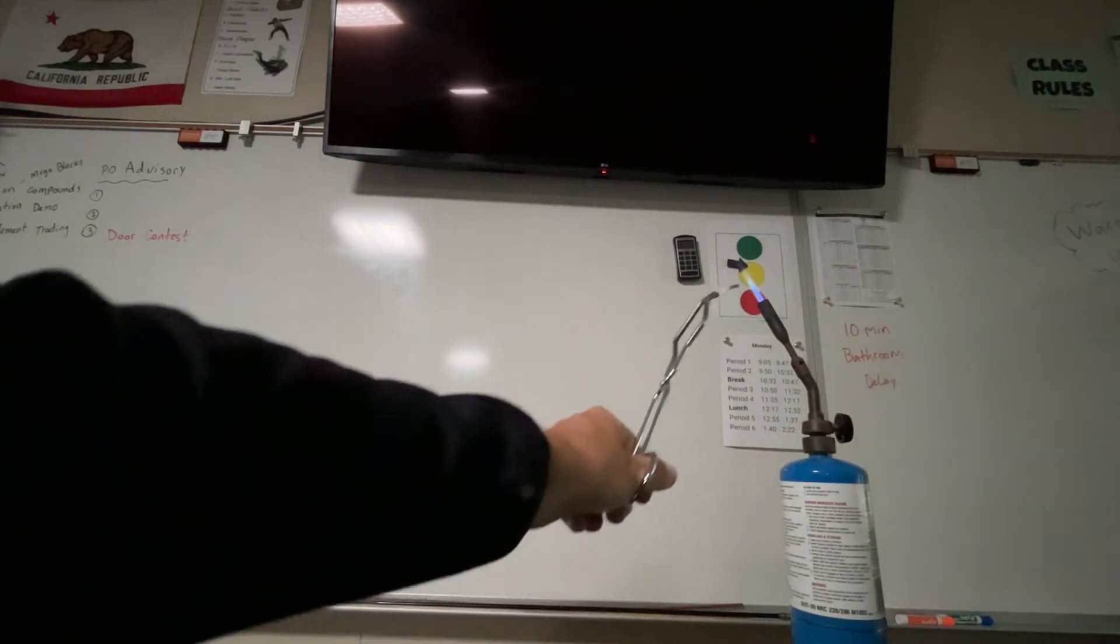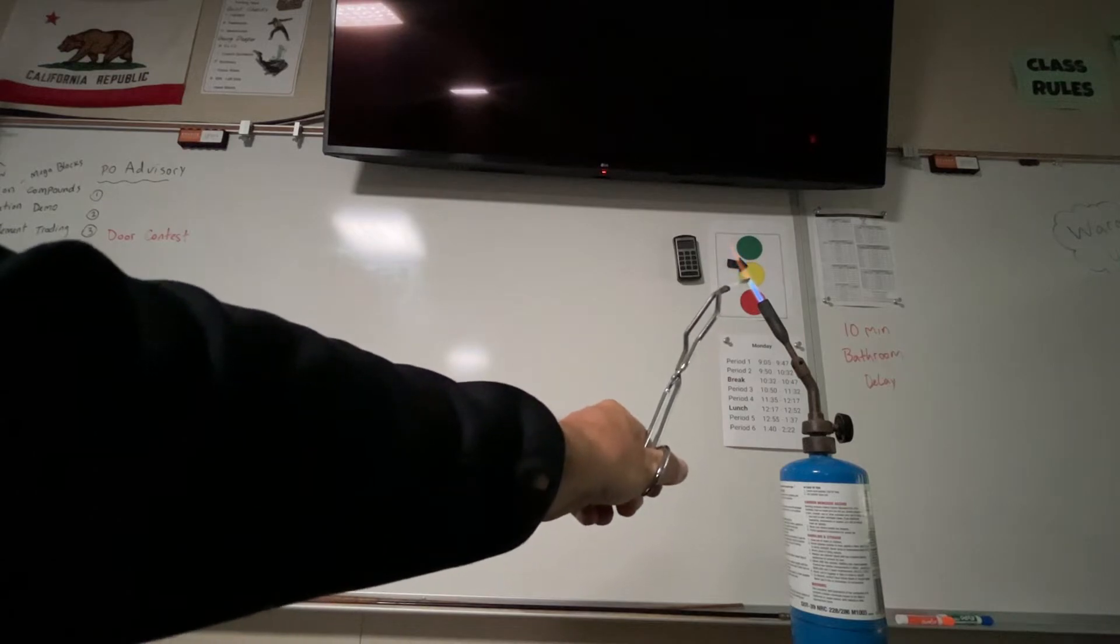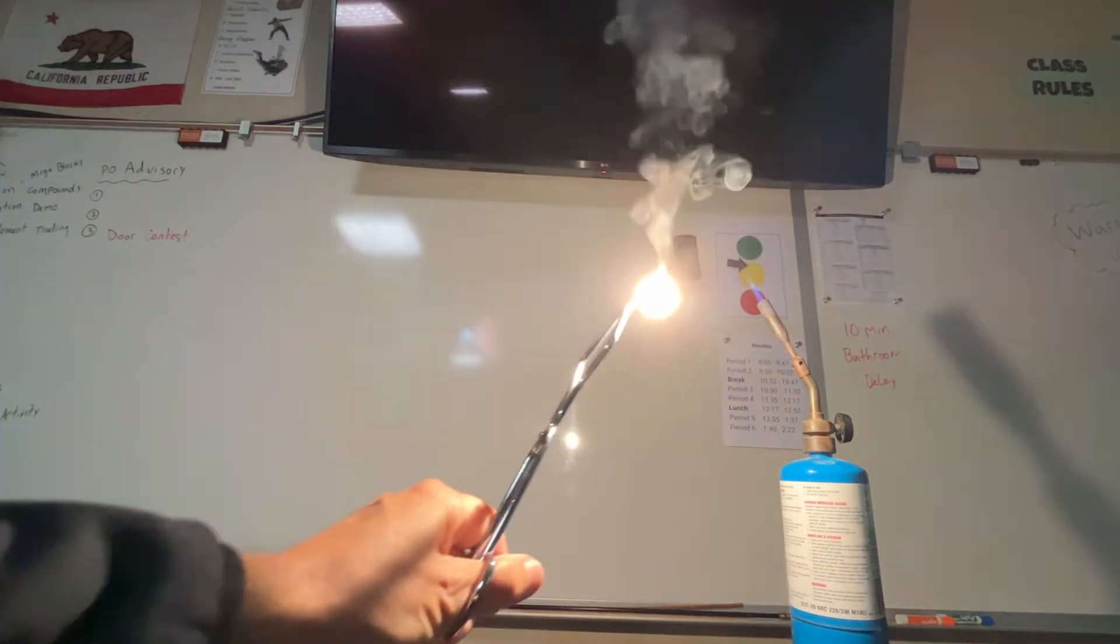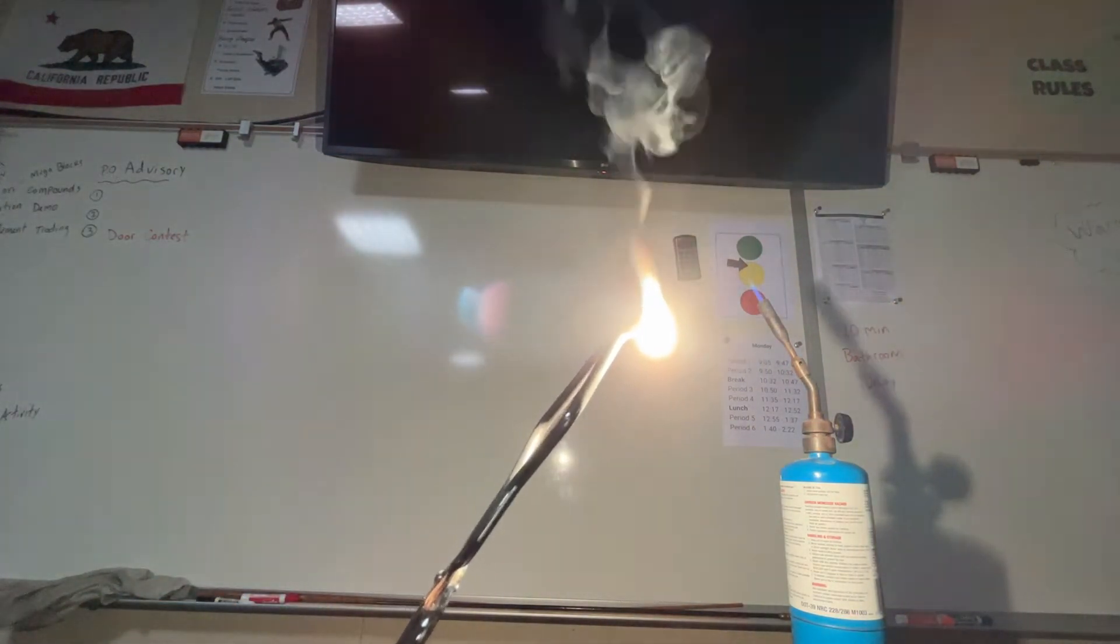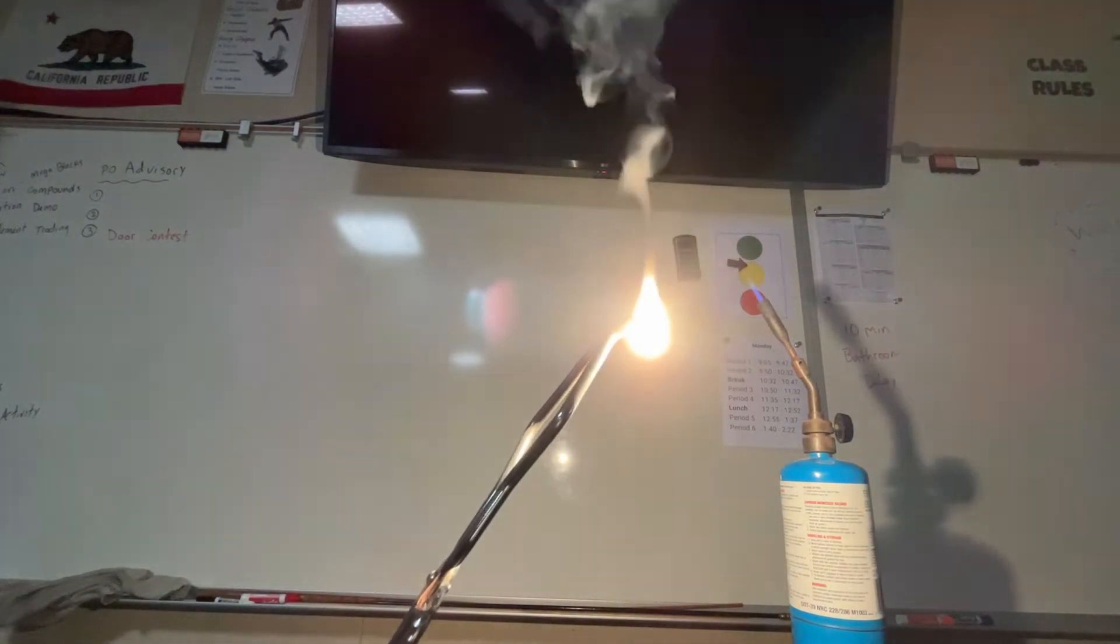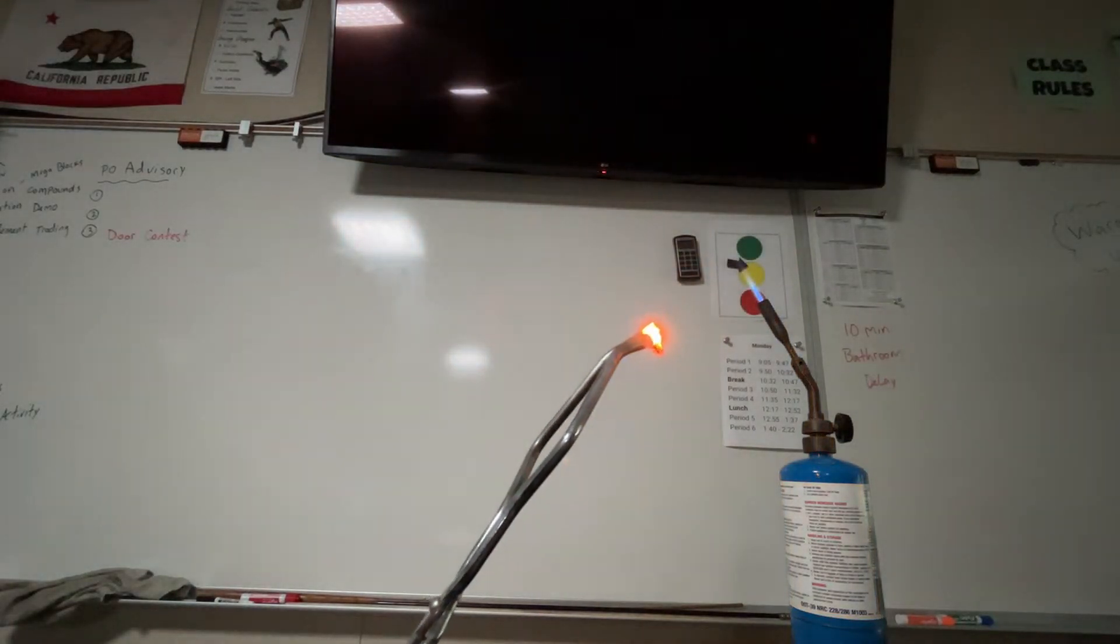Here we go. Oh, that's it. I call it Harry Potter light. And it's done.